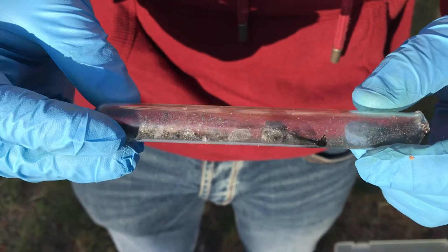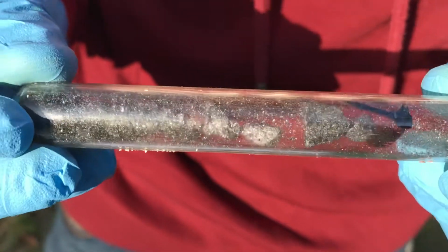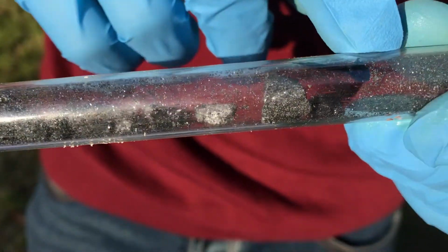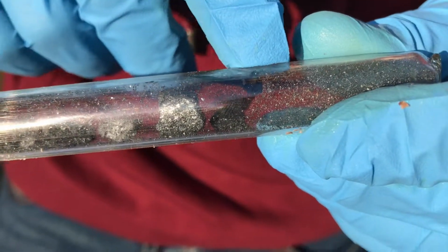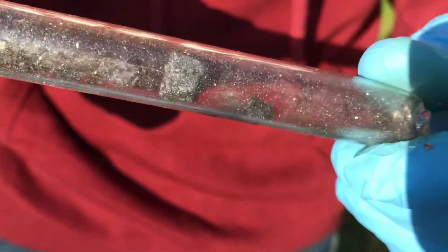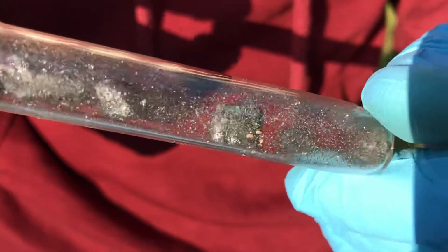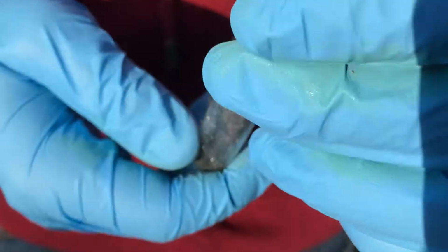The last in my collection are my crystals of iodine. I have obtained them by sublimating the iodine into iodine vapors, and when it touched a cold wall, it deposited nice and shiny crystals. The iodine has the property of sublimating, which makes it easy to disappear, leaving only the iodine smell behind. I also keep it in an ampule, after that incident with the citric acid crystal.